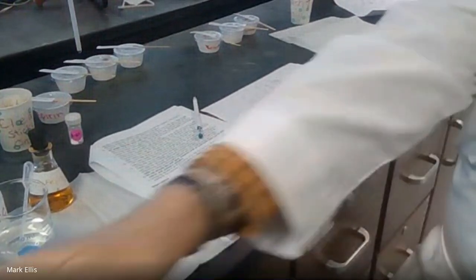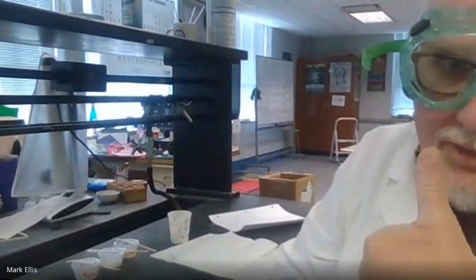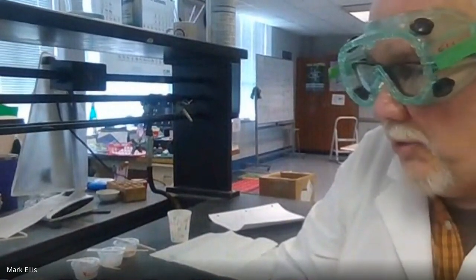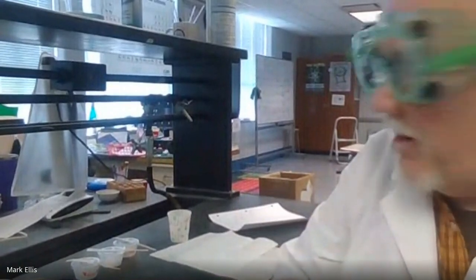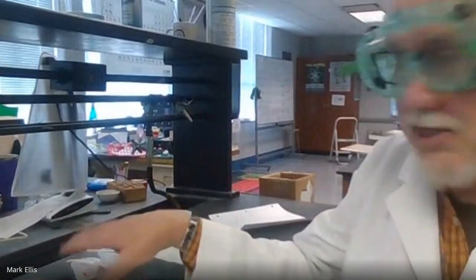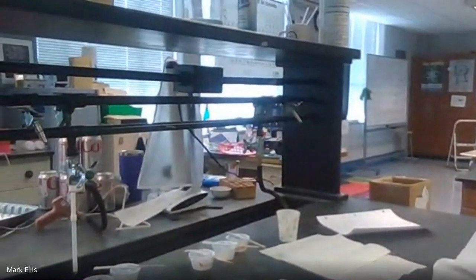Forgot to put my goggles on, but I'll do it now. Most of the things we deal with on this lab are pretty safe, but the hydrochloric acid, you don't want that in your eyes. The iron-3 nitrate might sting a little bit, but I wouldn't want that in my eyes either. And some of these powders can easily flake up. It hits you in the eye, so wear your eye protection.